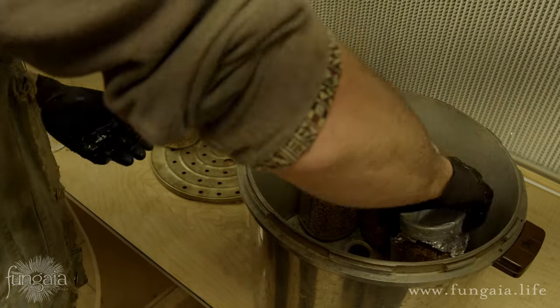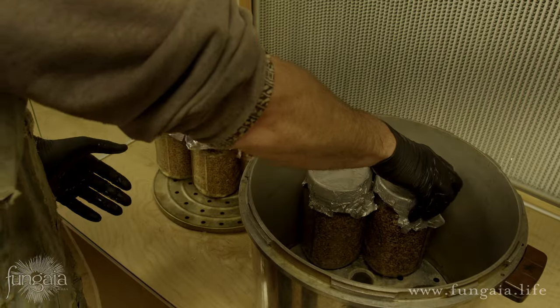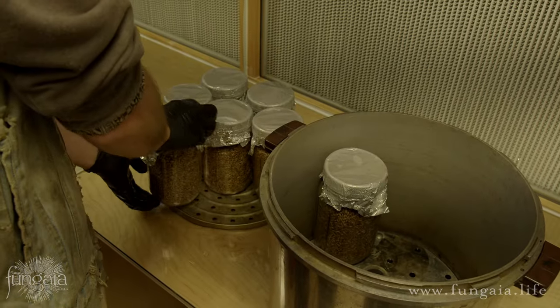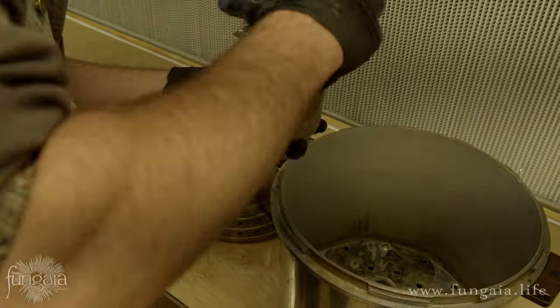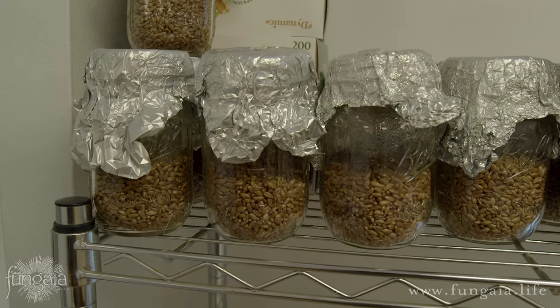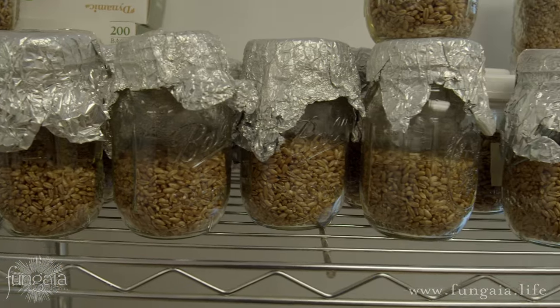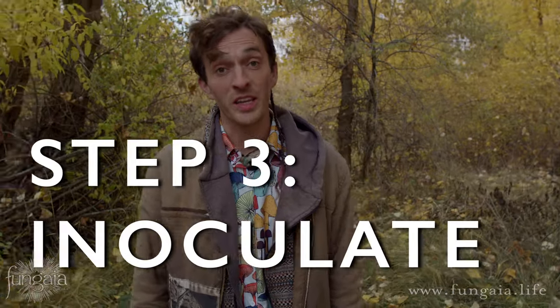For best results, open your pressure cooker as soon as it reaches atmospheric pressure, then tighten down the jar lids and allow them to cool. Be especially careful not to burn yourself. At this point the jars should remain completely sterile as long as the lid remains unopened.